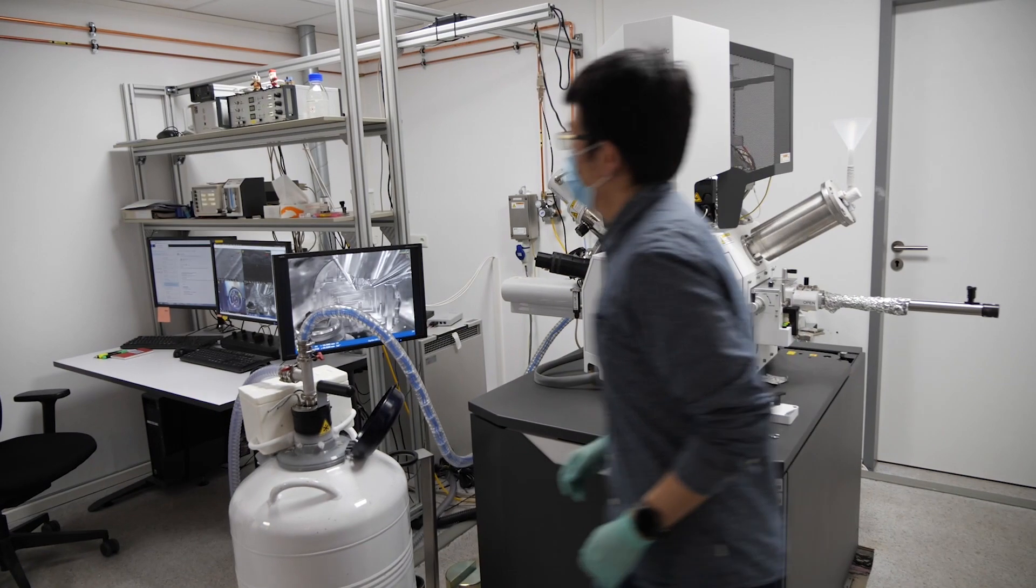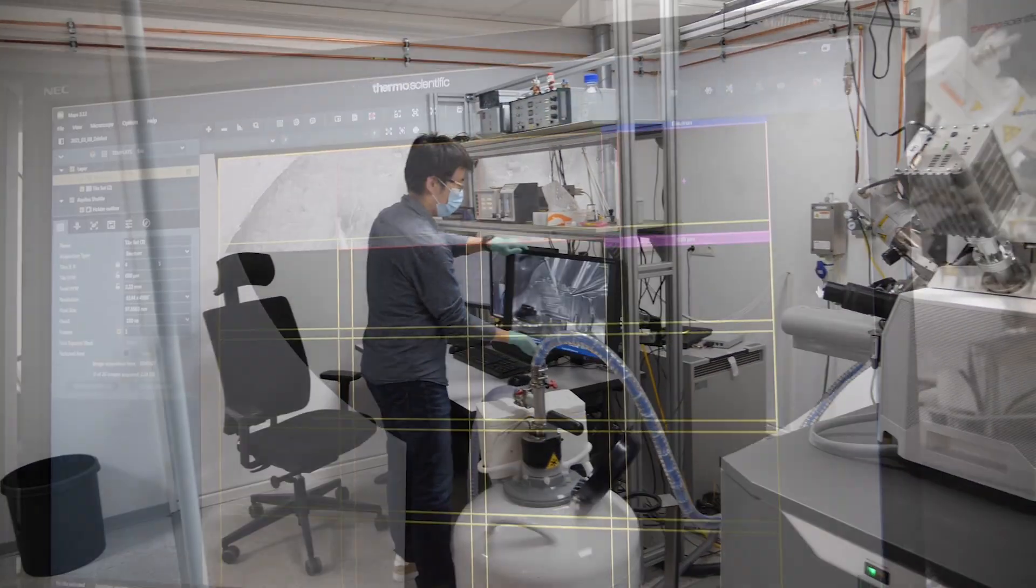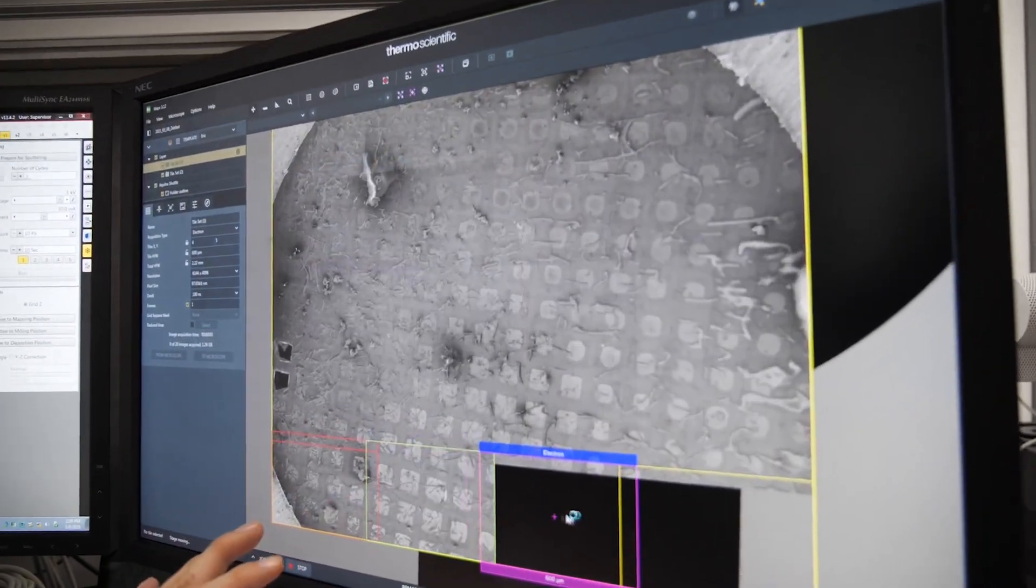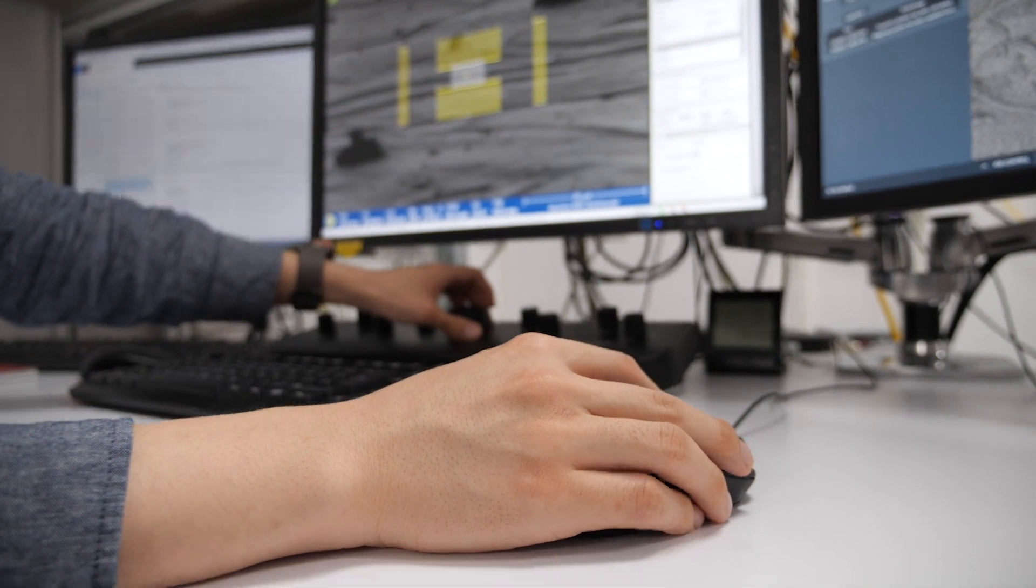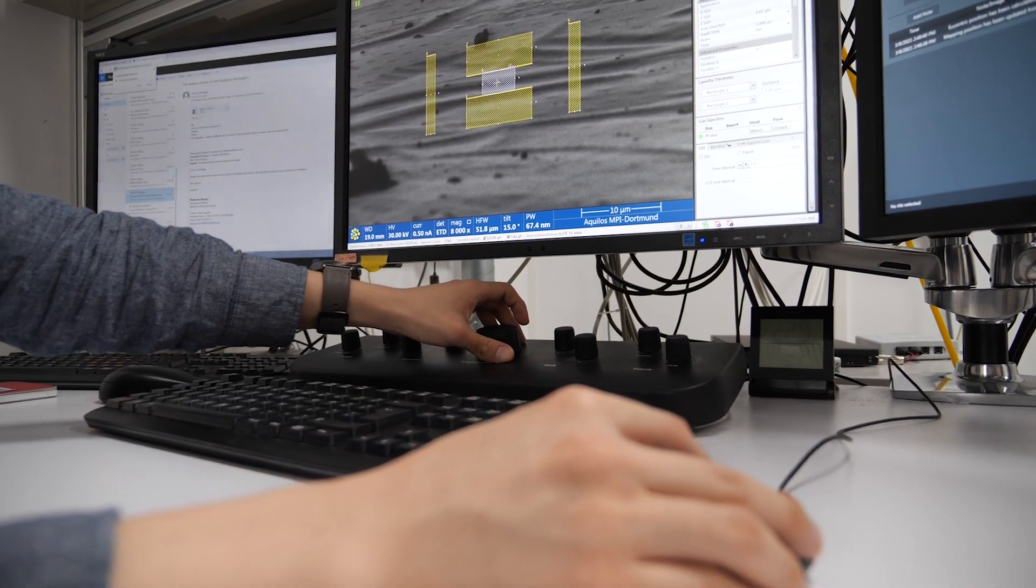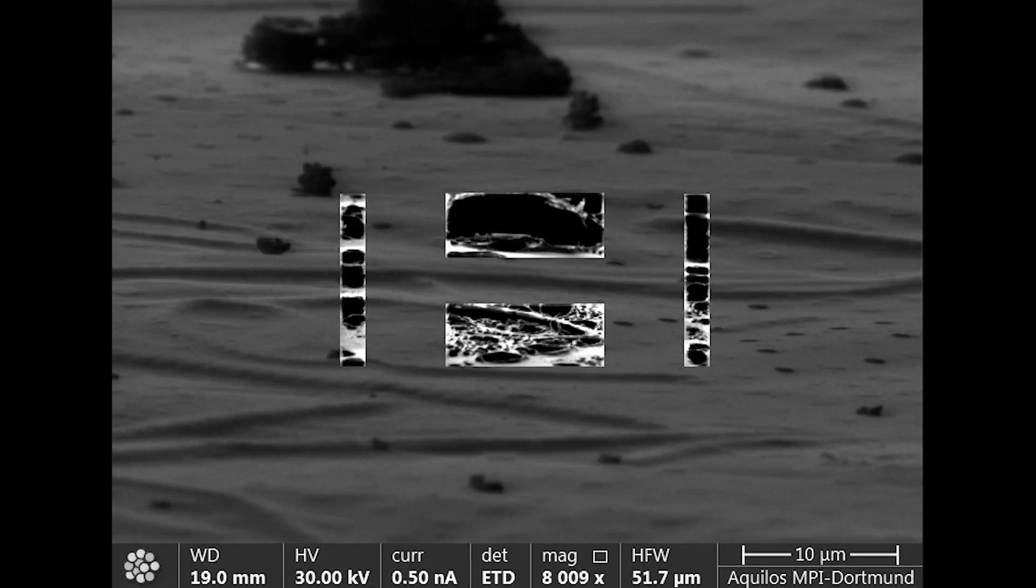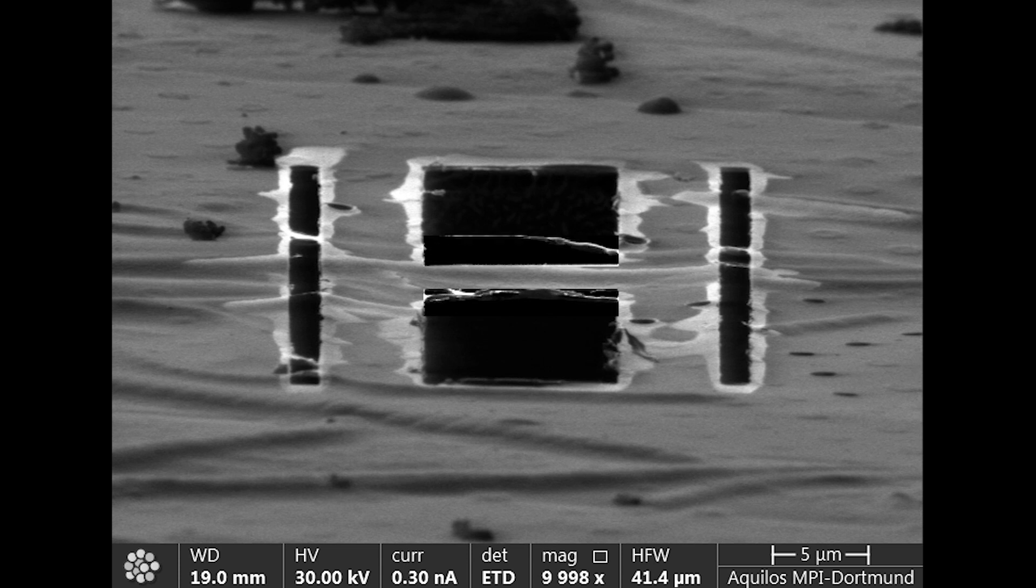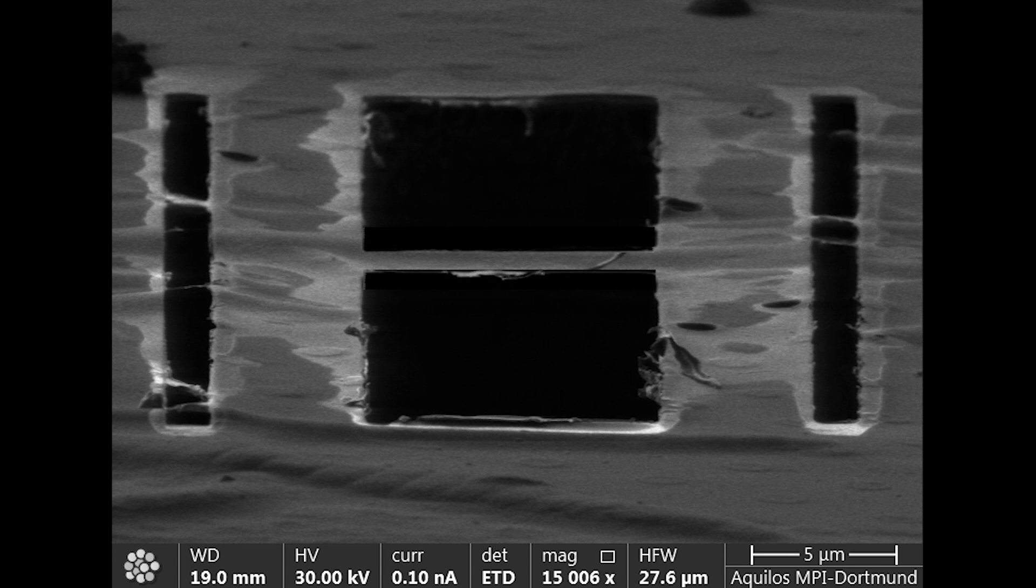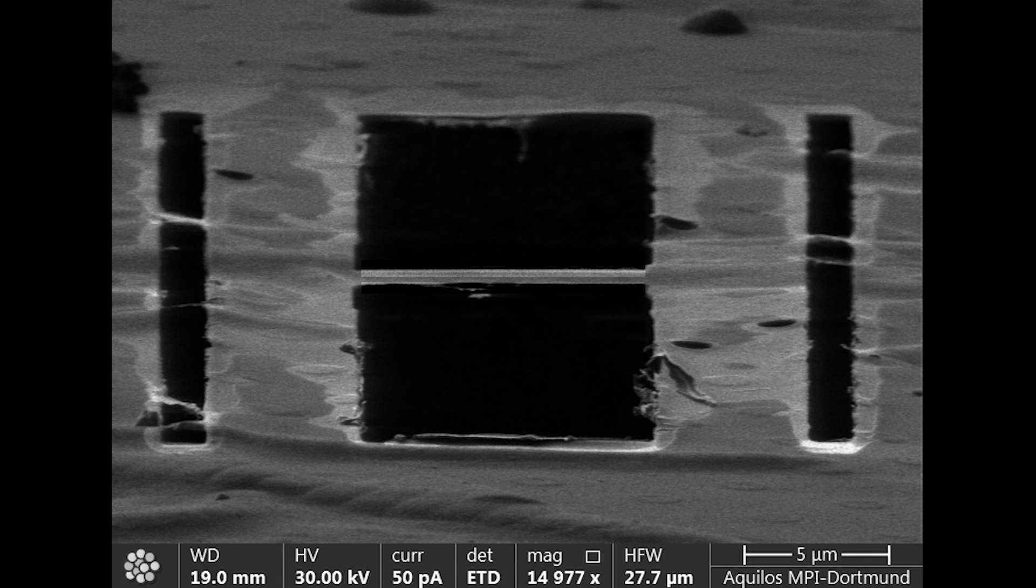The Aquilos is a microscope equipped with both an electron column and an ion column. We use the electron beam to first image the entire grid and localize our target of interest. Then the ion beam is used to cut the frozen biological sample. During the milling process we first create large windows around our target myofibril by ablating the material with a high current of ion beam leaving a lamella in the center. Afterwards the lamella is thinned down by an ion beam with smaller current to below 150 nanometers, thin enough for electrons to pass through.